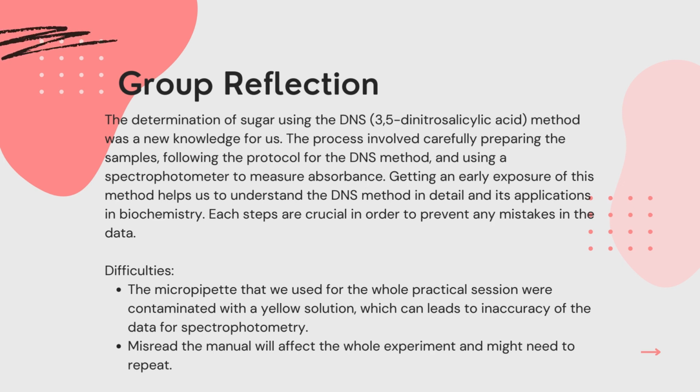As for the difficulties, first, the micropipette that we used for the whole session was contaminated with a yellow solution, which can lead to inaccuracy of the data for spectrophotometry. Thus, we used other groups' micropipettes to prevent this situation from happening. Second, misreading the manual will also affect the whole experiment, and we might need to repeat it again.